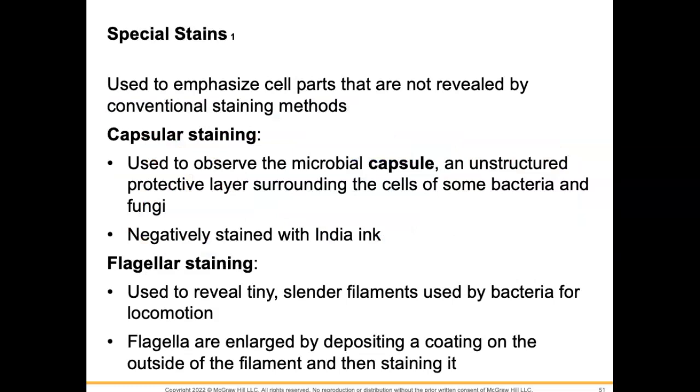All right. Let's see. So special stains used to emphasize cell parts that are not revealed by conventional staining methods, specifically capsular staining, used to find or see the capsule of a microbe. Flagellar staining, used to basically reveal the flagella in bacteria or protozoa for that matter.